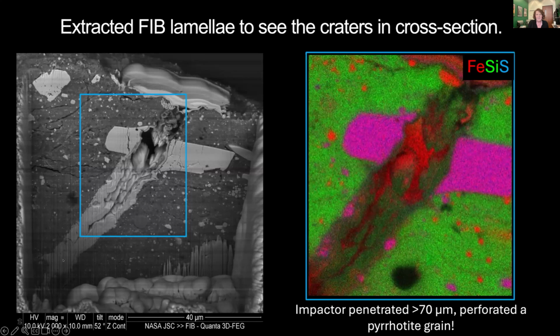So these kinds of analyses can tell us information about what the population of impactors looks like, where in the solar system they are coming from, what kind of composition they must have had in order to penetrate this deeply into the sample, and gives us a clue about the environment at the surface of asteroid Bennu.